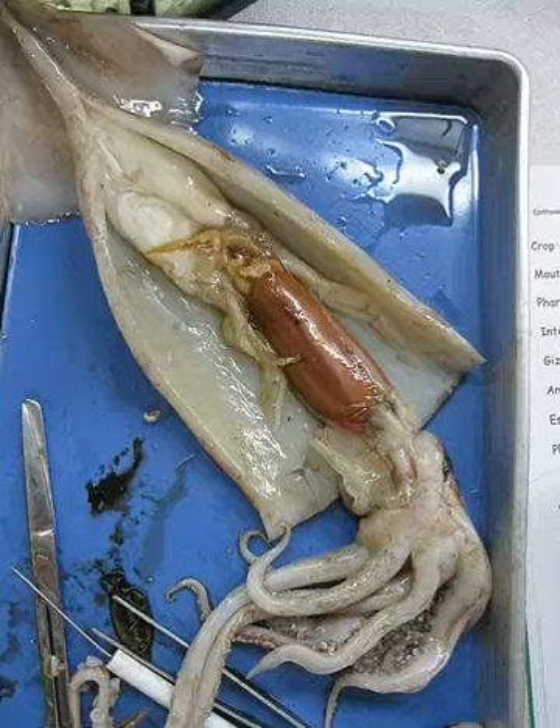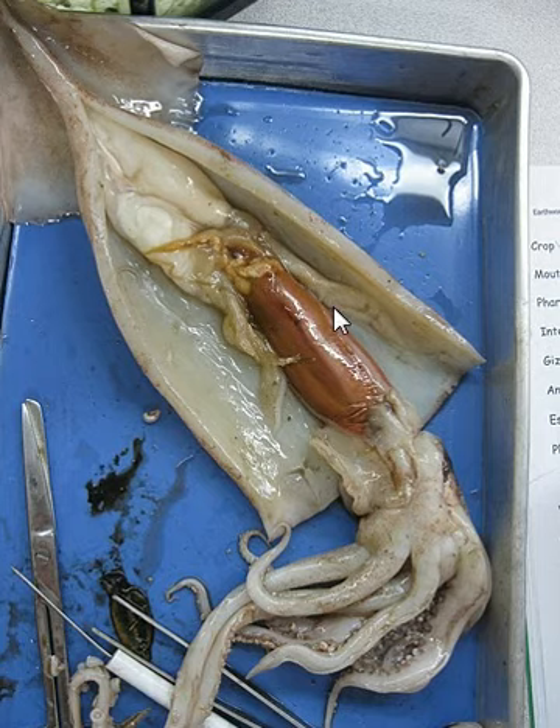Hi, this is our squid and we dissected it. What you see here is the dissected squid that I did with Misha. In this squid you can see the liver and the reproductive organs.